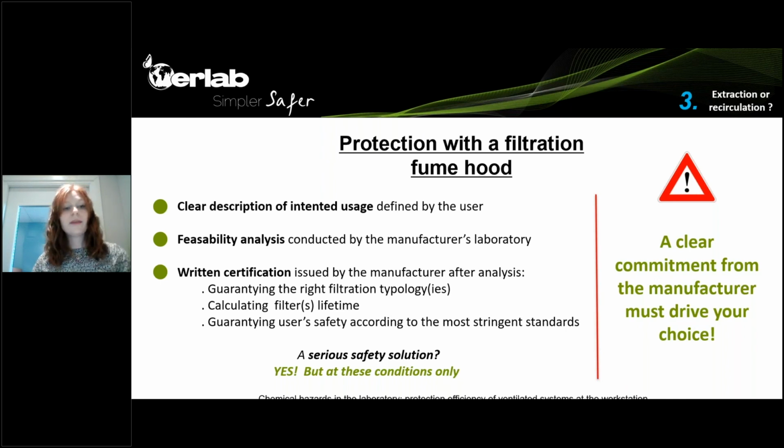So really, this analysis is done by the laboratory to make sure that it is a safe solution for the specific laboratory. And then a written certification issued by the manufacturer after the analysis, that is going to give different information to the user. First of all, the right filtration typology that is guaranteed by the laboratory, a calculated filter lifespan that is given to the customer even before using the fume hood, as well as a certificate that is going to guarantee the user safety according to the most stringent standards that we've seen previously.